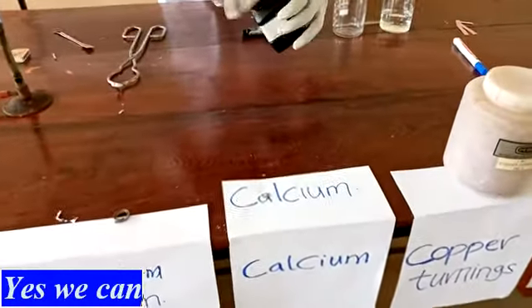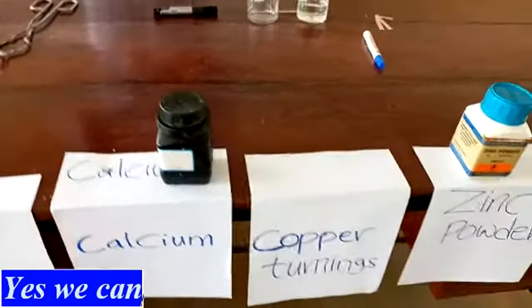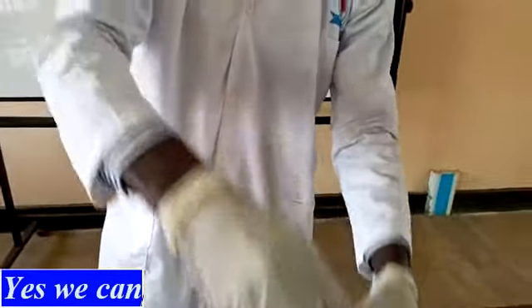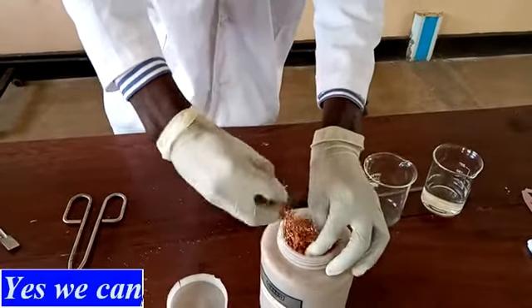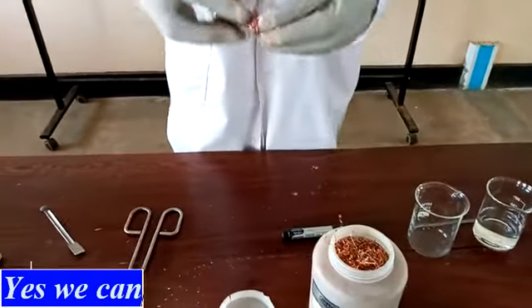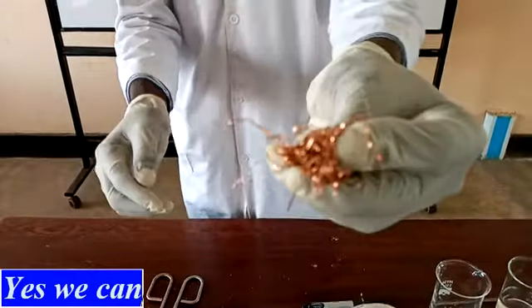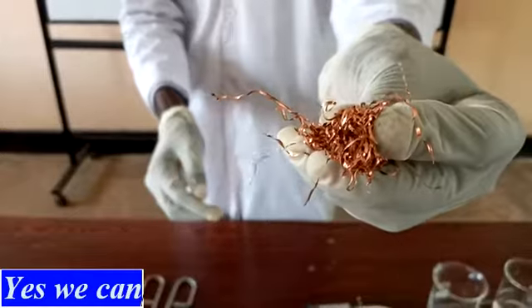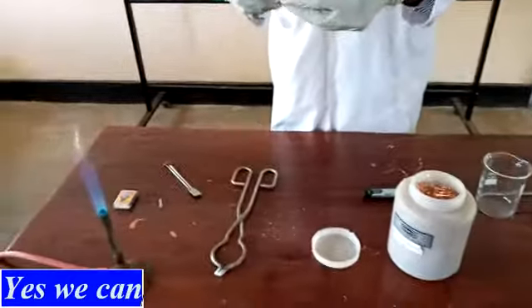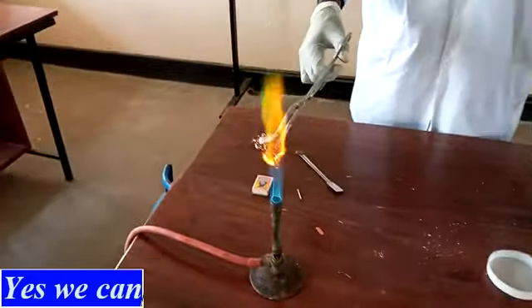Then we have the next metal there, which is copper. Copper exists in many forms. This one is called copper turnings. So, this is copper. And what is its color? Please note the color down. Good, that is copper turnings. So, we want to burn copper turnings. And you see the color of the flame and the color of the product formed.